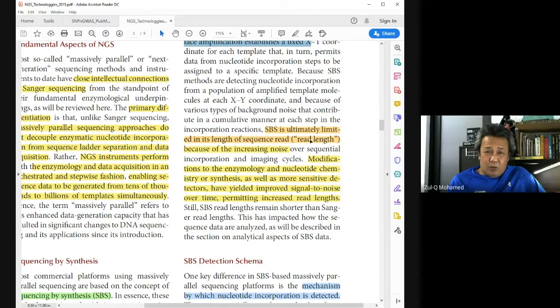What you want is a very, very high signal to noise ratio, meaning what you get is always signal and only very few noises. But if your signal to noise is equivalent, then you have a very, very bad system, because if you increase the length, there is increasing noise.